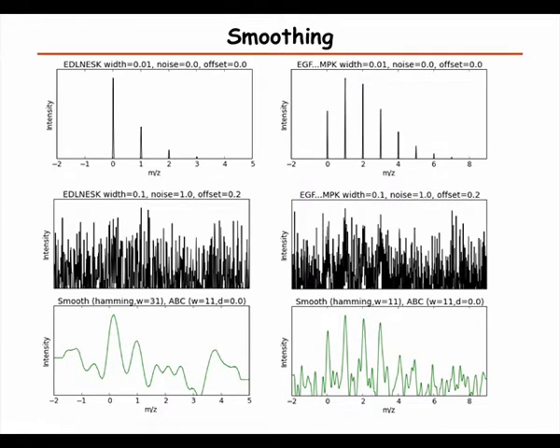And here is another case where we almost can't see the peaks from the noise, but then we can get quite nice peaks. But again, we shift the peak slightly, and we don't get back the accuracy.